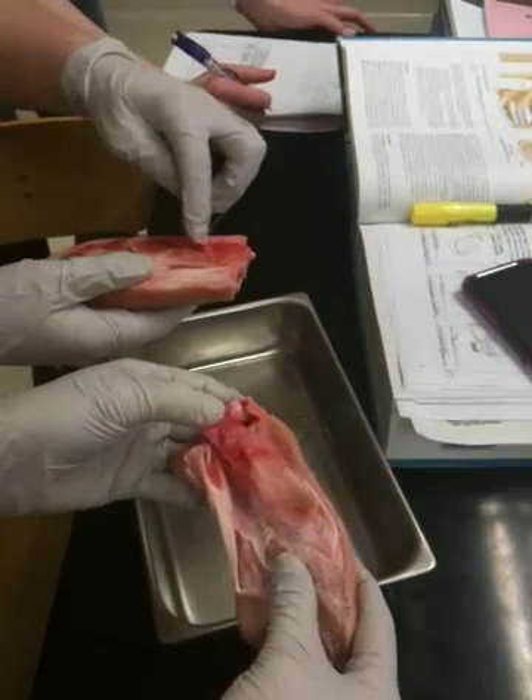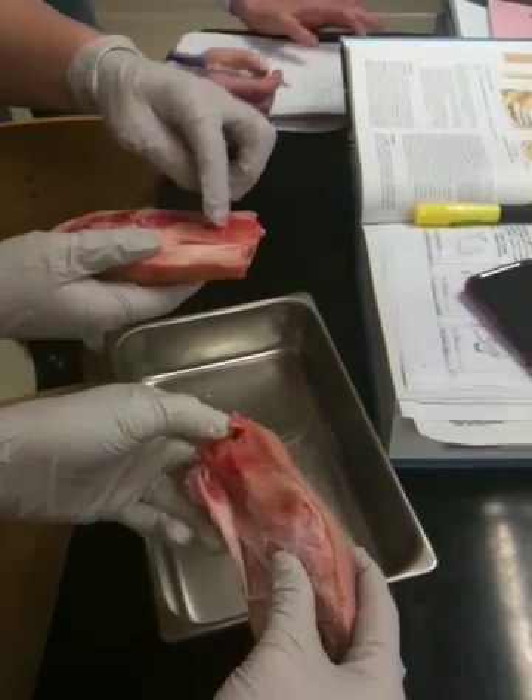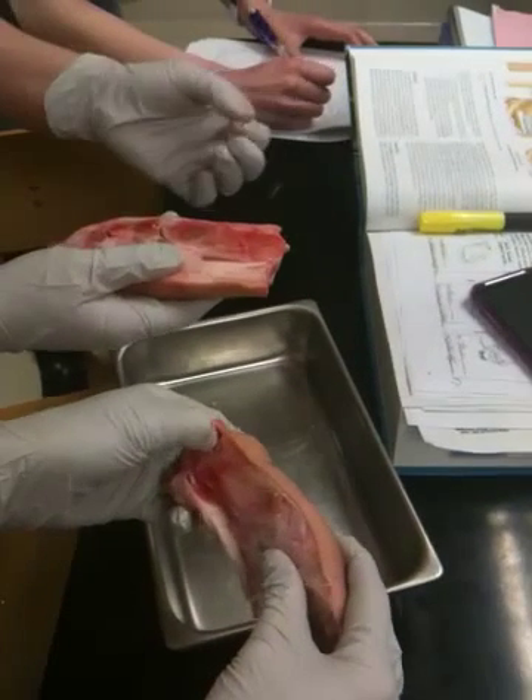The yellow bone marrow — that's where it's found. That's what's in the medullary cavity. That's what this goopy stuff is — that's the yellow bone marrow.